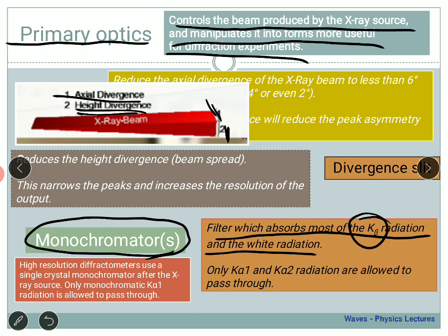You have to remember that K alpha 1 and K alpha 2 lines are very close to each other. The wavelength difference is very narrow, so they can be considered almost monochromatic. In practical application, actually it is the average of K alpha 1 and K alpha 2 that is taken. For example, if we consider 1.54 for copper, that is nothing but the average of these two lines.